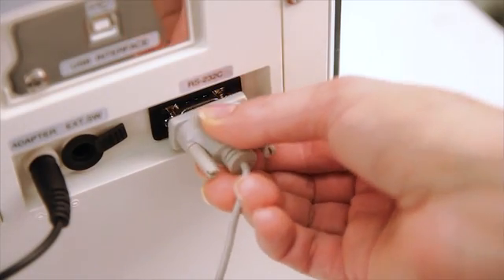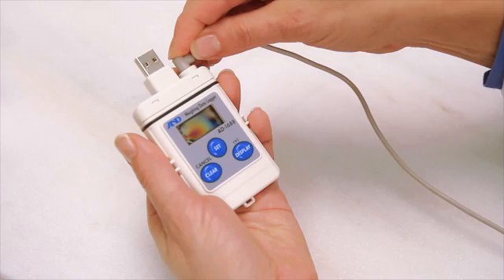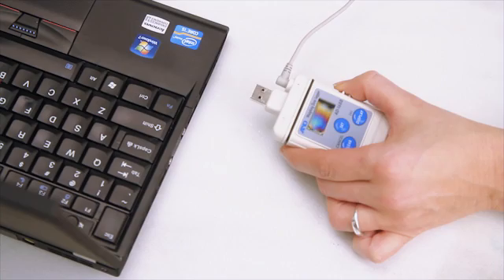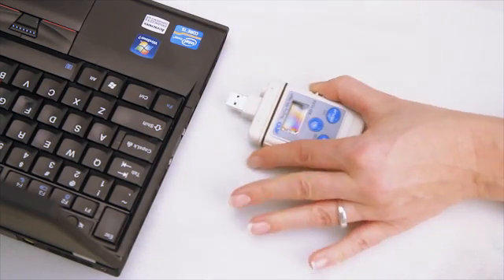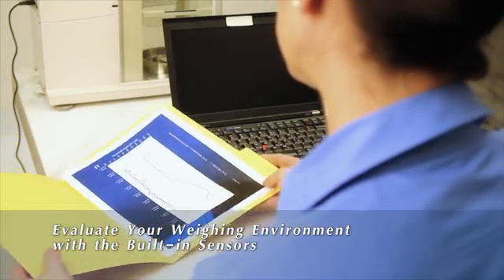The AD1688 data logger, included with all ION series balances, records weighing results together with environmental readings from built-in sensors. You can do this over a 24-hour period without the need for a PC.